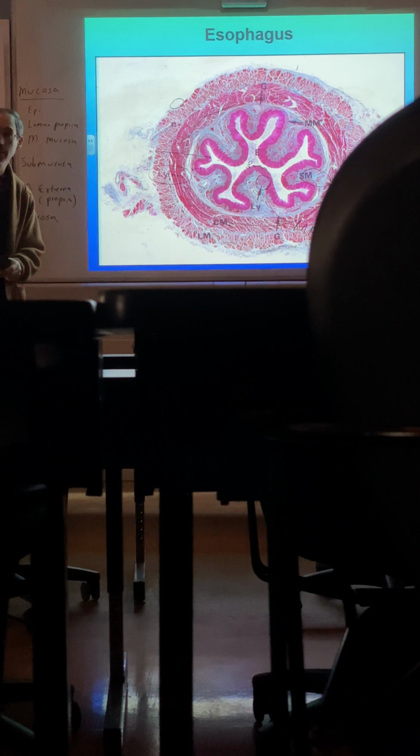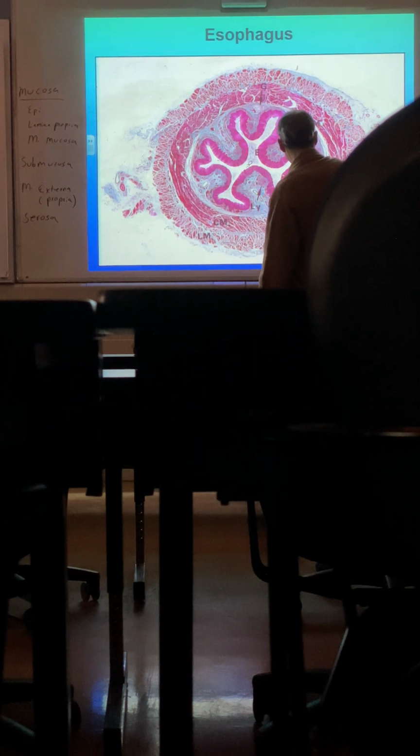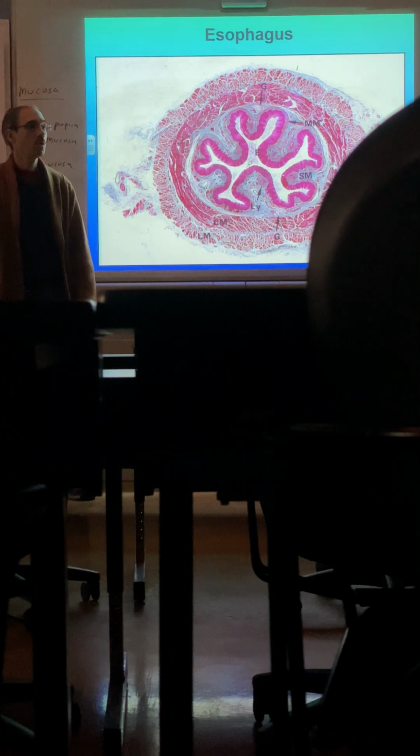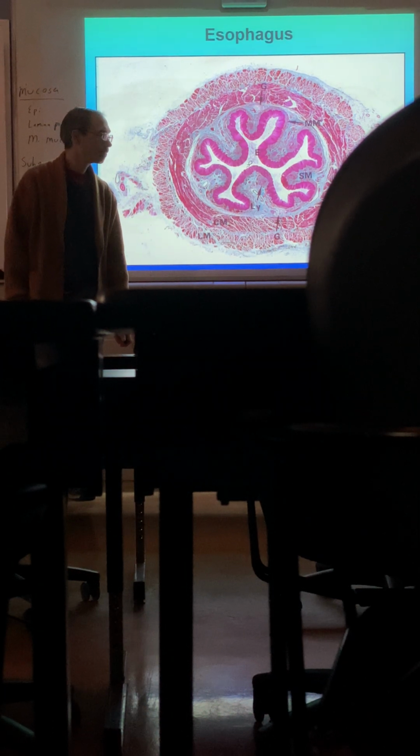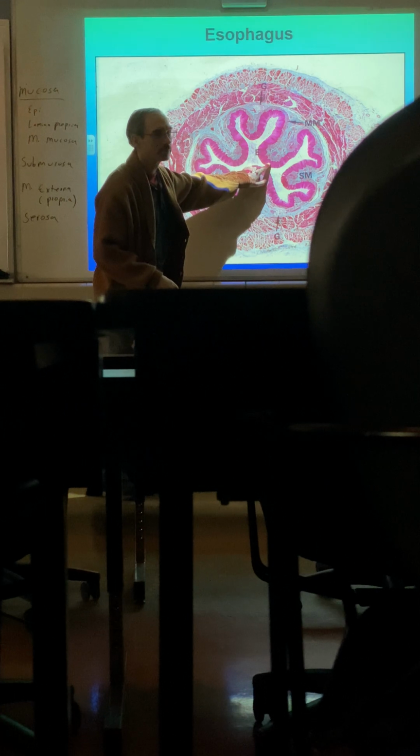Any questions on this? You said the epithelium of the esophagus is just stratified, or is it stratified? Squamous. Stratified squamous. You can actually see how thick it is.